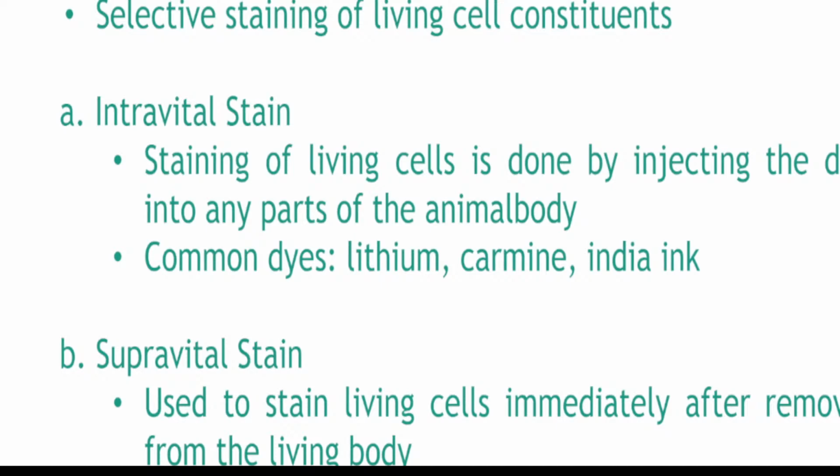What's an example of a supravital stain? Reticulocyte techniques, right? Because we want to stain the reticulocytes. Using what? Yung methylene blue, di ba? Okay? Now, in histopathology, you'll hear Janus green and neutral red. It's the best vital dye. And Janus green is used usually for mitochondrial stains.